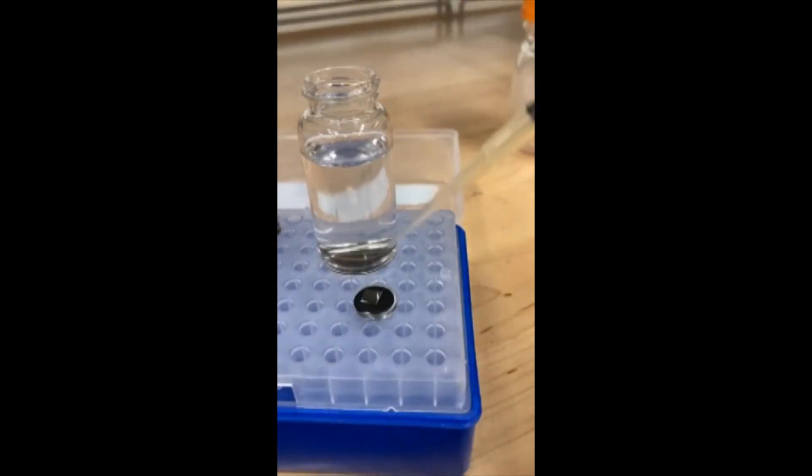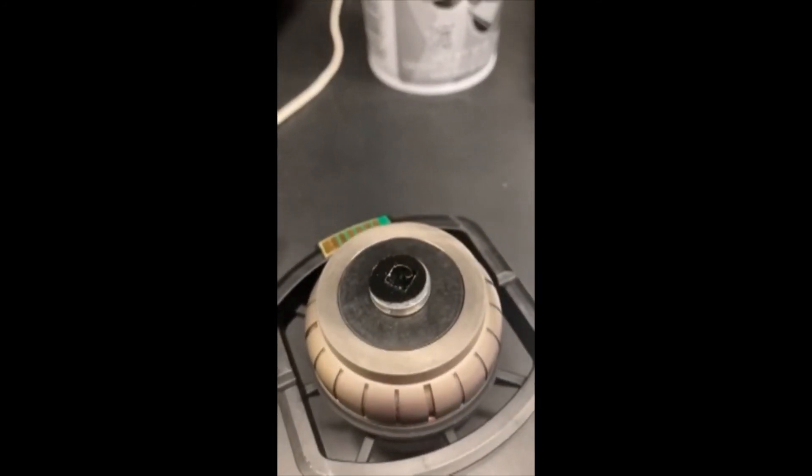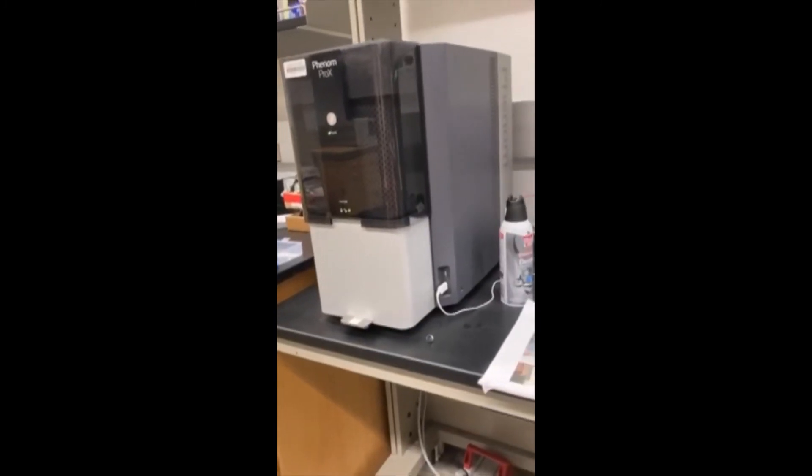To evaluate our nanoparticles, we prepare scanning electron microscope samples by drying a drop of the silver suspension onto a silicon chip that's mounted to a specimen stub.